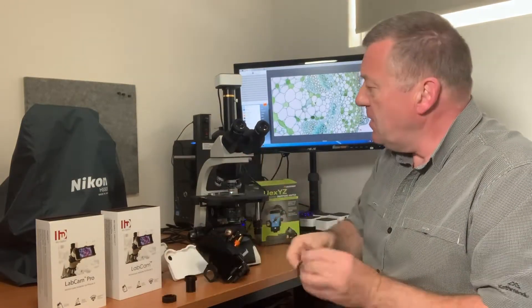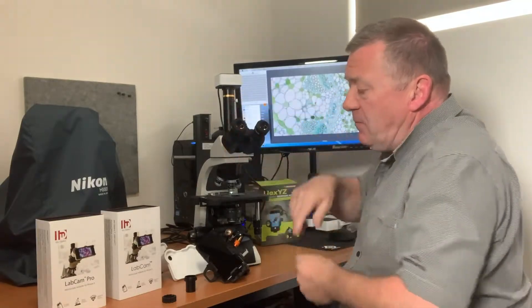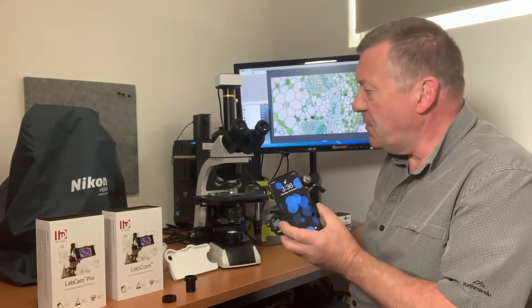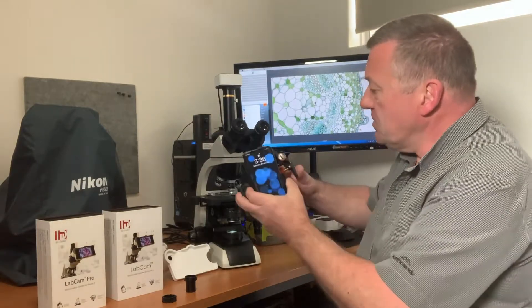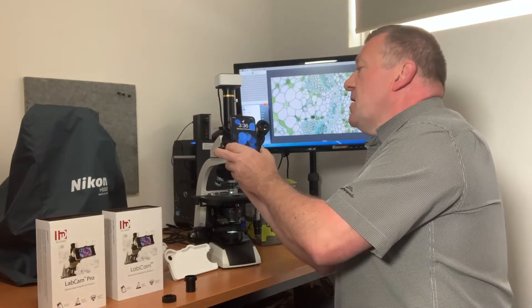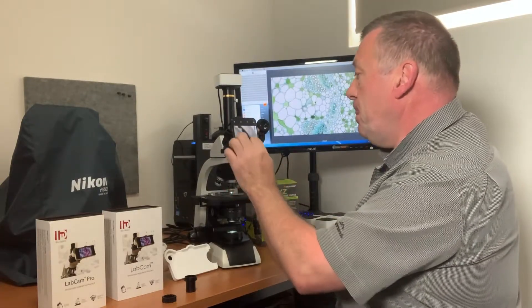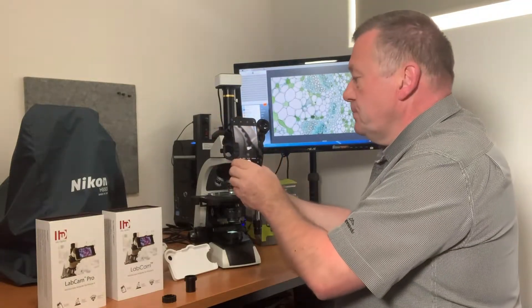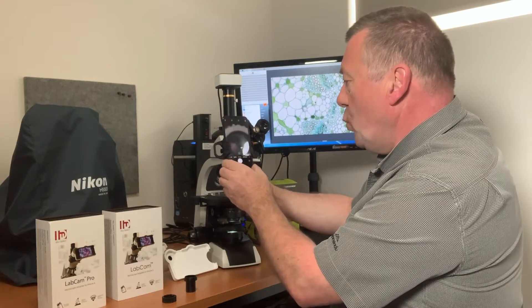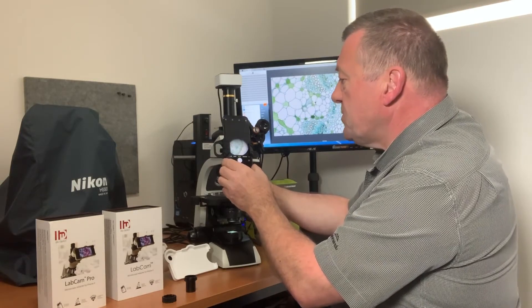It comes with two eyepiece holders: a 30mm and a 23mm. With the Celestron, you actually keep the eyepiece on the microscope, unlike the LabCam which has its own independent lenses — you're relying on the lens of your phone to take photographs. You adjust the clamp to fit onto the eyepiece and tighten it up, turn on your camera, then adjust the XY mechanism to center it with the eyepiece to find the sweet spot.